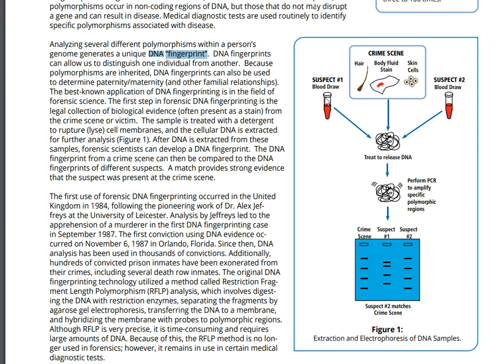And with that said, you can also take direct blood, right? No problem there. This DNA gets released. This DNA has to be cleaned up a little bit because there's tons of other things inside of cells that we don't necessarily need. It's just like trashy, messy rooms, and we just need to get the DNA out and get it as clean as possible. So there's a little bit of cleanup work in there.